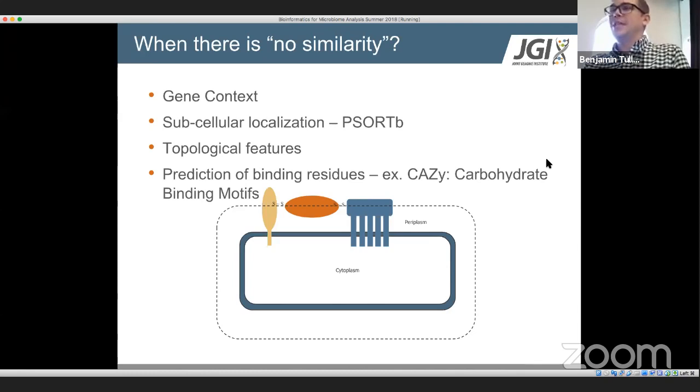So this is one of those things, it's more of a warning than it is anything else. What you can do a lot of the times with things that have been misannotated is you get at it a little bit more confidently if what you're looking at has overlap between multiple databases, right?